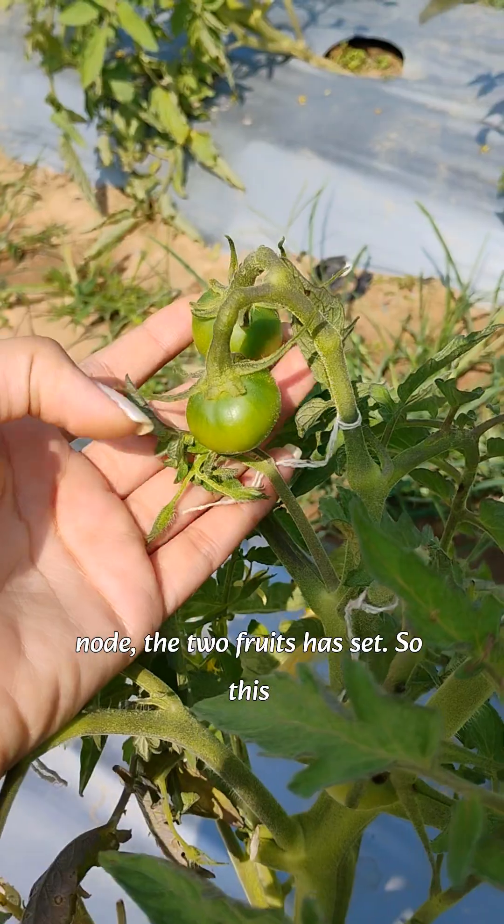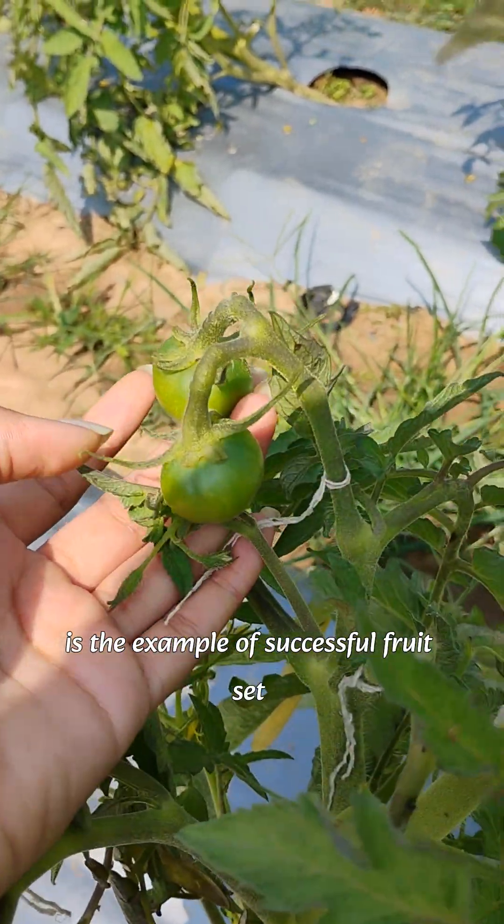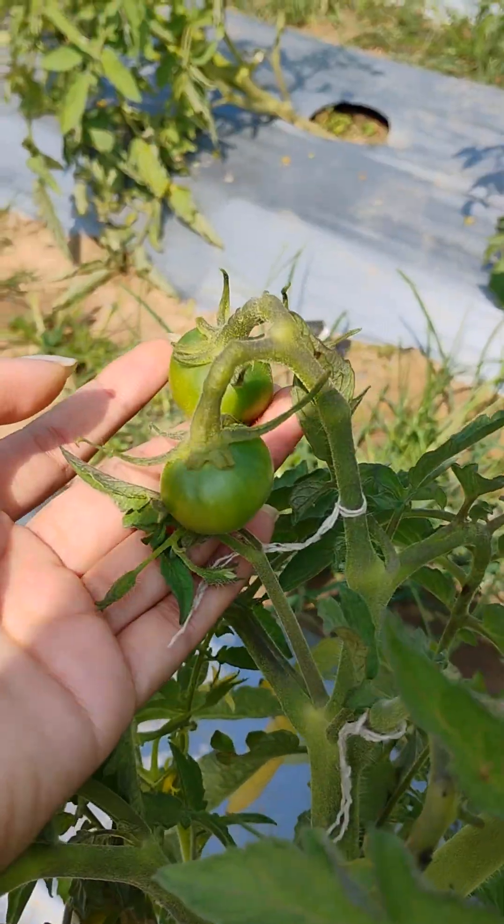As you can see, from the same node two fruits have set. This is the example of successful fruit set from successful pollination. Bye bye.